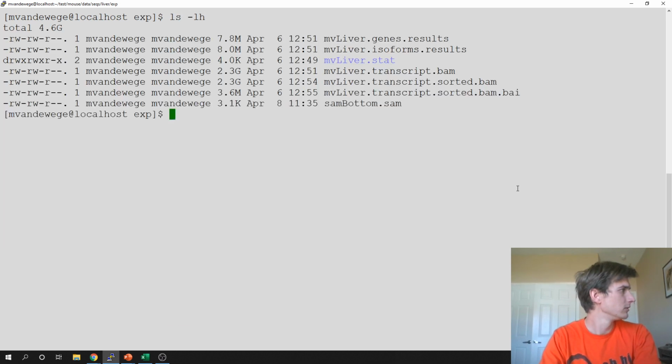So in this directory, I have my output from RSEM, which is a genes result, an isoform result. So, oh man, whoops, something has gone wrong. Okay. So if I'm looking at this file before classes, I'm messing up. I'm doing stupid things.